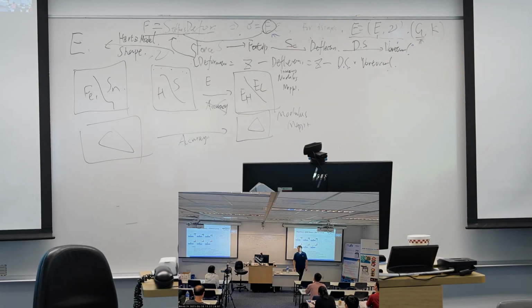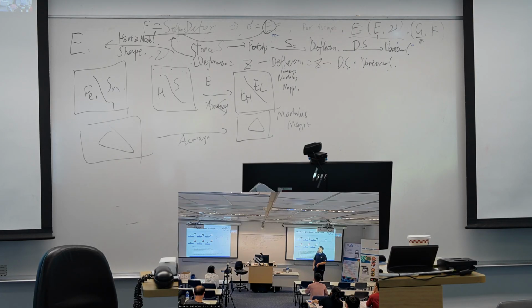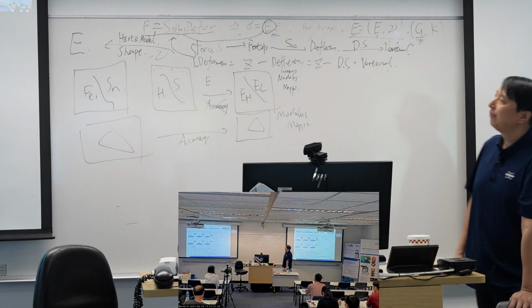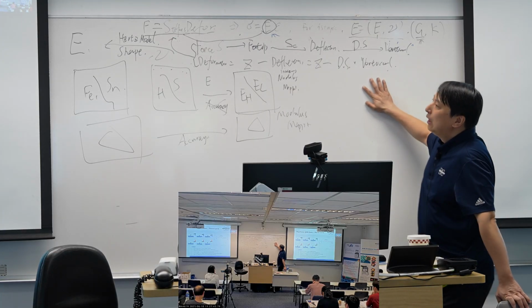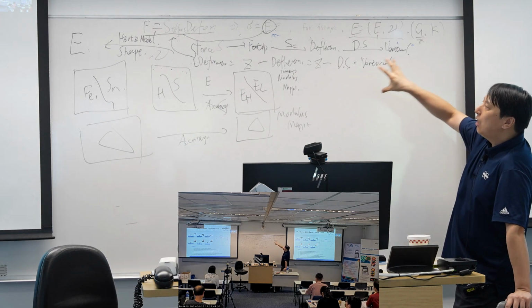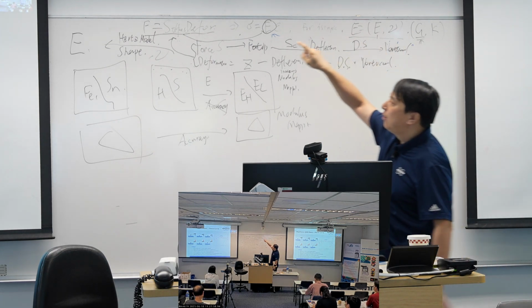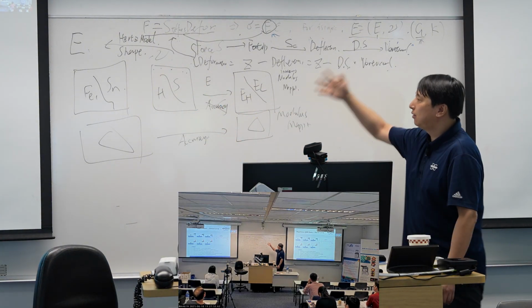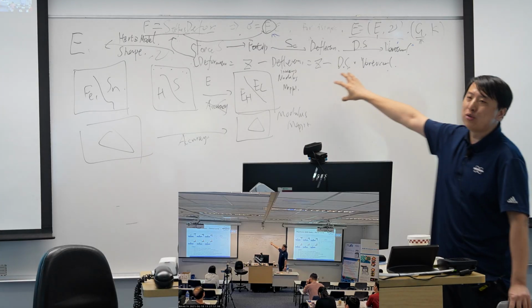Calibration, as we will demo this afternoon: if you want to do it carefully, yes, it requires some time, and it requires you to prepare your samples very carefully. But if not, skip it. Just type in any value. So the idea of PeakForce QNM is to help you do the force curve on each point quite quickly, and then we can get the modulus mapping.